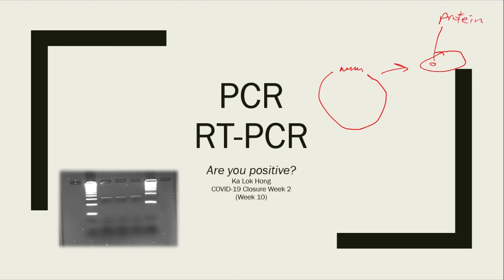Now here we talked about last time how to screen for those using part of the construction of the plasmid, i.e. having some type of an ampicillin resistant gene, or having some LacZ gene to do the screening for successful cloning.